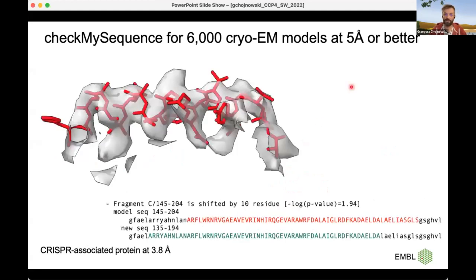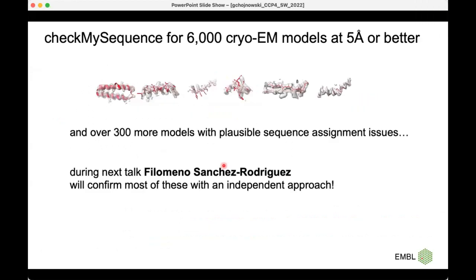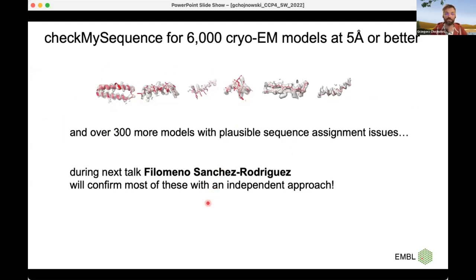Another case is easy to fix after changing the geometry of the main chain slightly, moving the side chain, and assigning to the sequence shifted by four residues. One peculiar case: all chains in the structure are shifted by 10 residues from start to end, and the backbone is completely fine — something must have gone very wrong during deposition. I've shown only six prominent issues, but there are over 300 more models out of 6,000 tested with plausible sequence assignment issues, though it's impossible to prove all the errors right now.